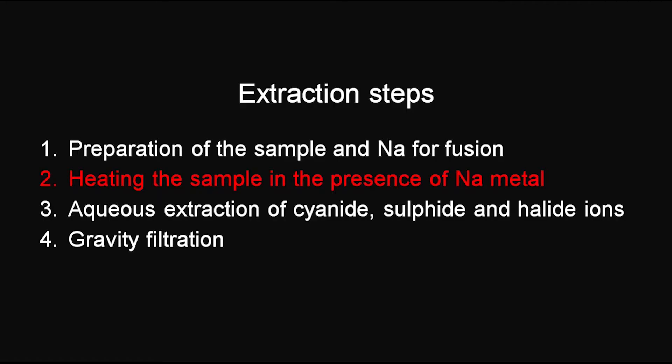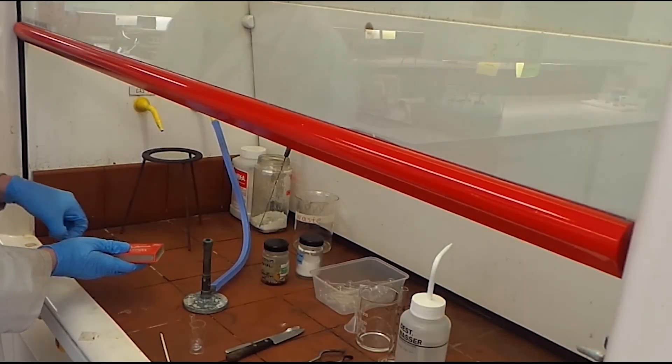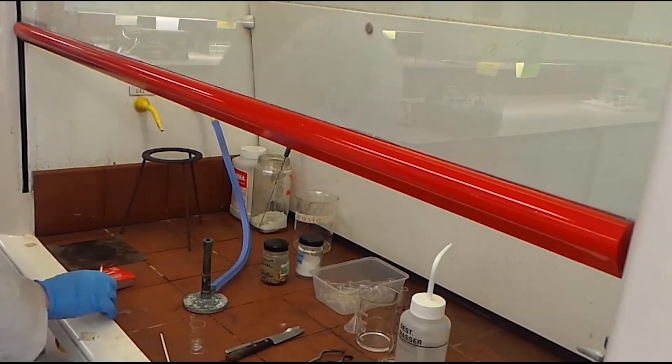After preparing the sodium and your sample in the ignition tube, the tube needs to be heated. After carefully turning on the Bunsen burner, remove any unnecessary items from around the Bunsen burner. Be sure to have your beaker of water close by.